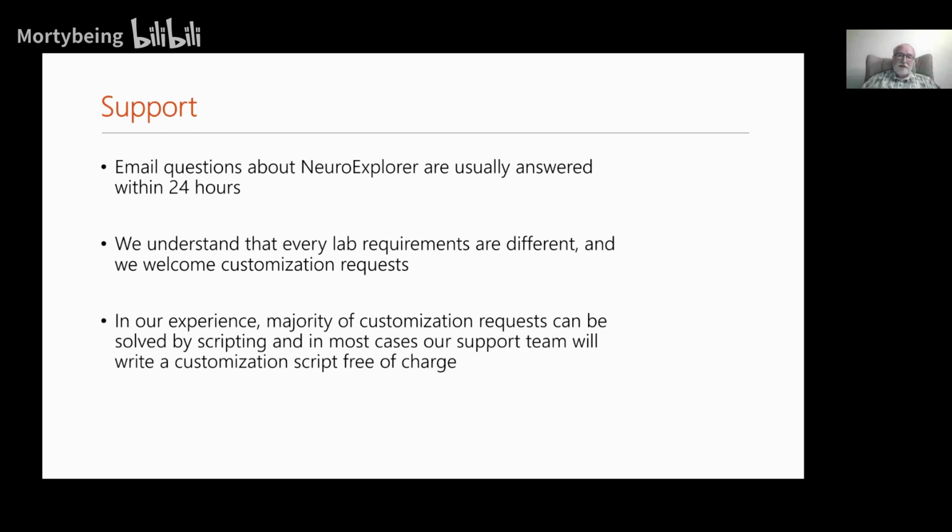Another good thing to know for your customers is that the program is highly customizable, and a lot of requests can be solved by scripting. In most cases, I talk to a customer, I write an initial script, and then the customer can later modify the script.